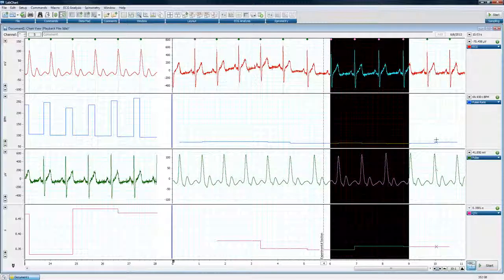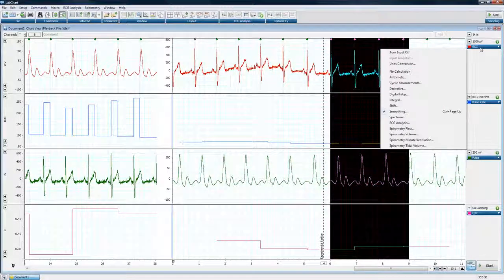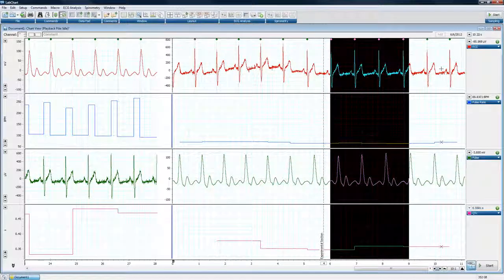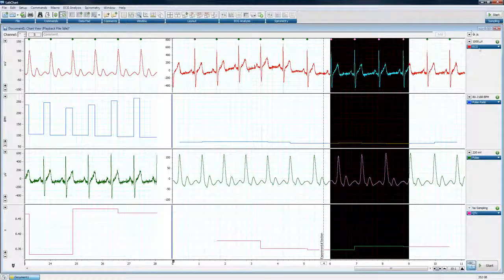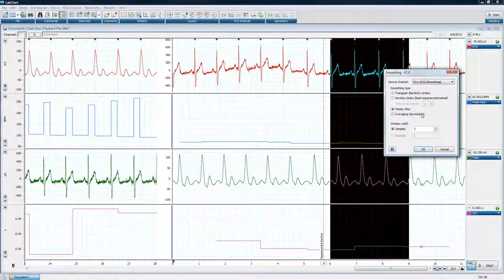And I don't think that was correct. And this is the next feature that I wanted to show you. Instead of having to go back to this pull-down menu, the last calculation that I was working with is available with a shortcut. If I press Control Page Up, it simply opens the calculation again. Okay, let me show you that one more time.